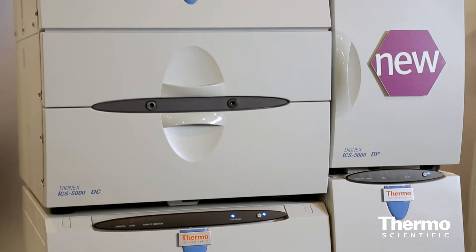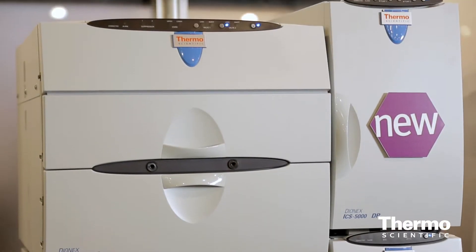The advantages for our customers is that they can speed up the separations, get their results in much shorter time, increase their throughput, or they can use new column materials with higher resolution to separate more complex samples.